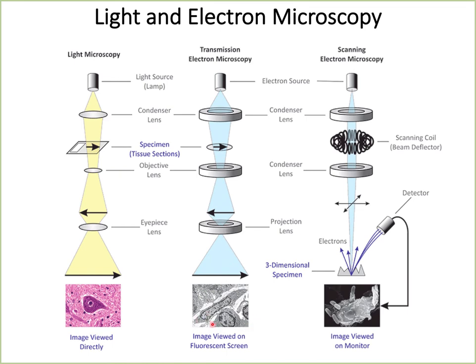That generates the contrast in the electron microscope. Remember, in the scanning electron microscope, no electron passes through the sample because the sample is coated by a heavy metal, and all the electrons are deflected depending upon the typical topography of the sample.